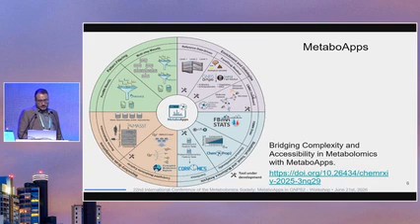Then we're going to have the CMMC dashboard that we're going to discuss microbial information for these data sets.